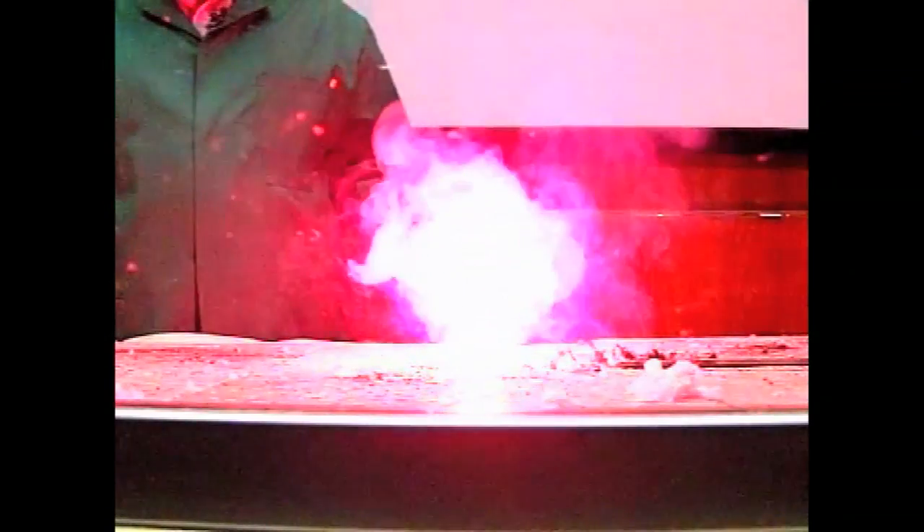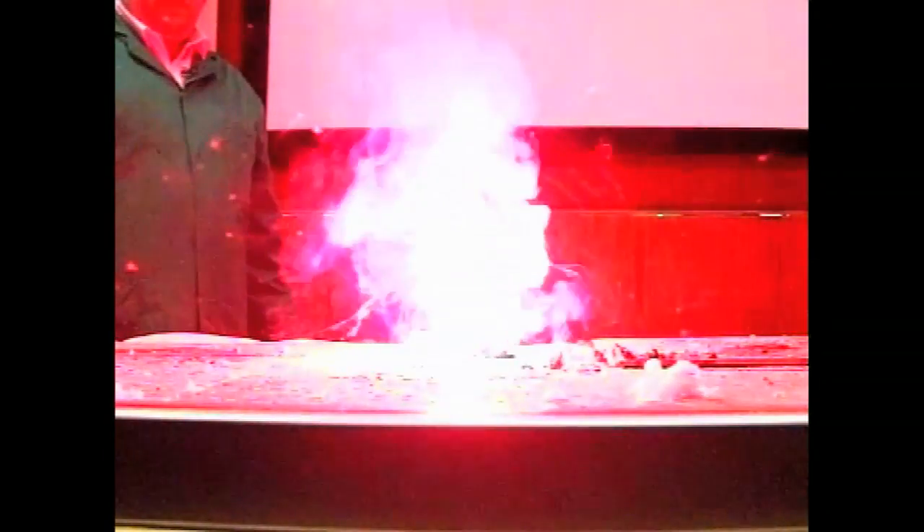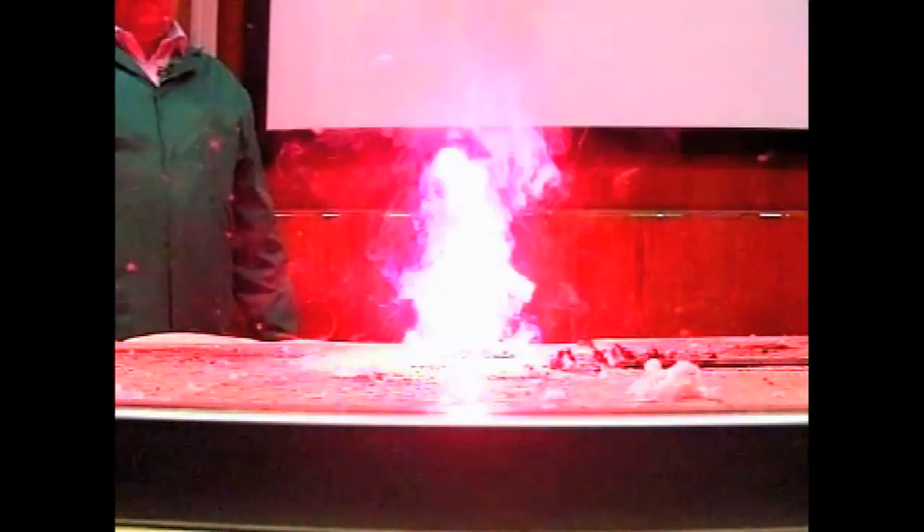Now all we need to do is add a little bit of energy. Wow, what a fantastic reaction! Really, really energetic - lots of energy coming out, lots of hot steam, lots of hot CO2, and importantly a lovely, lovely red colour from the strontium emission.